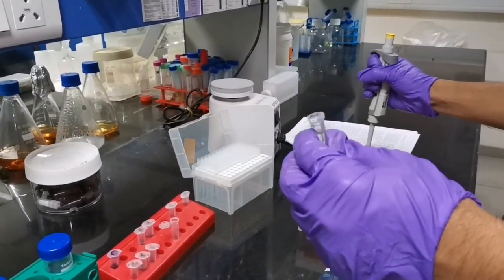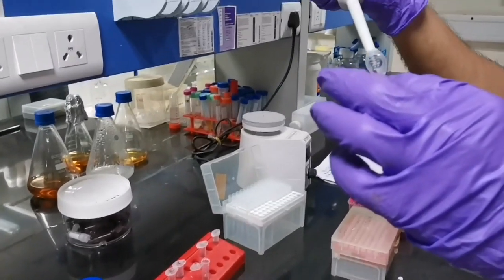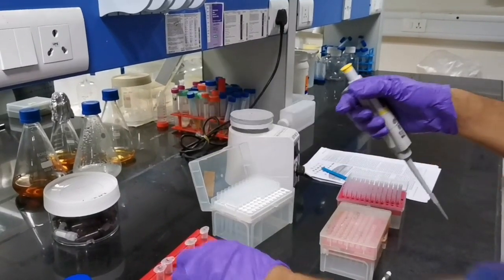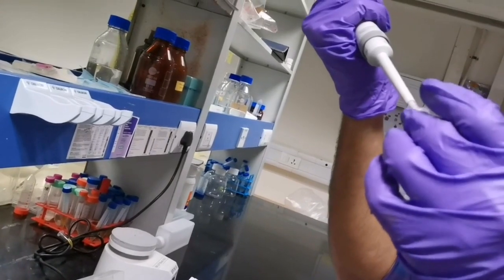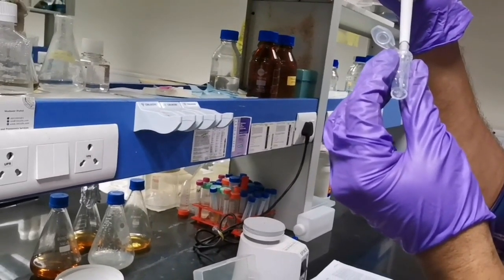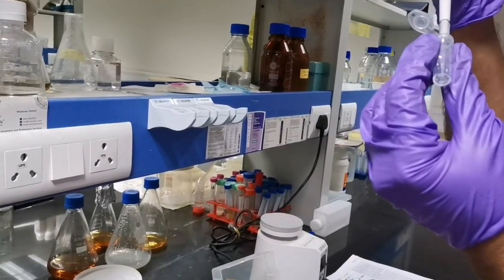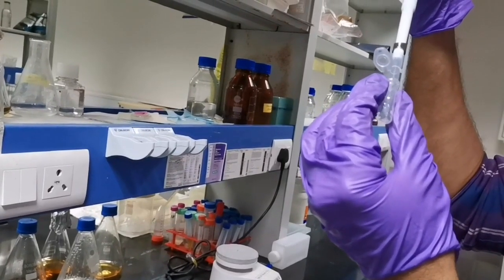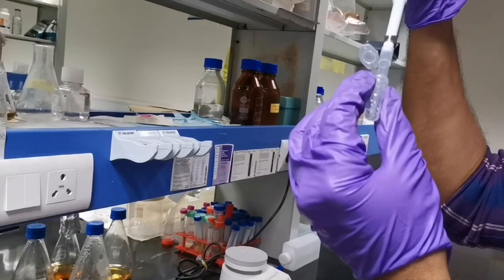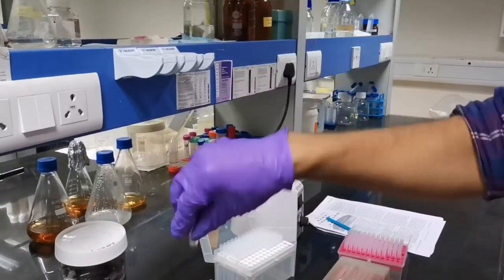and the RNase treatment is given so that any contamination of RNA will be terminated, to avoid RNA contamination in our plasmid. Now I am resuspending the pellet. After resuspending, I will keep it at 37 degrees temperature for half an hour.